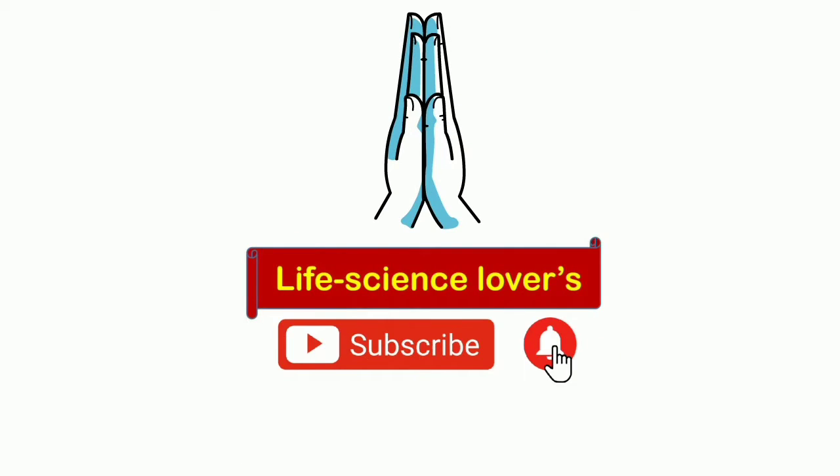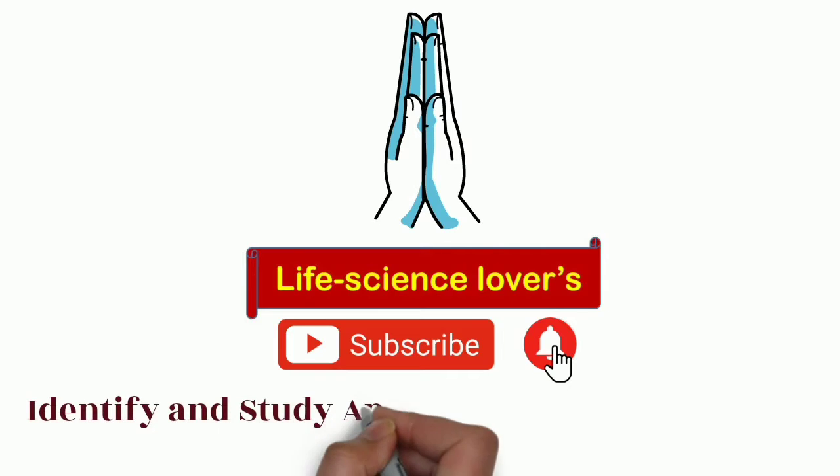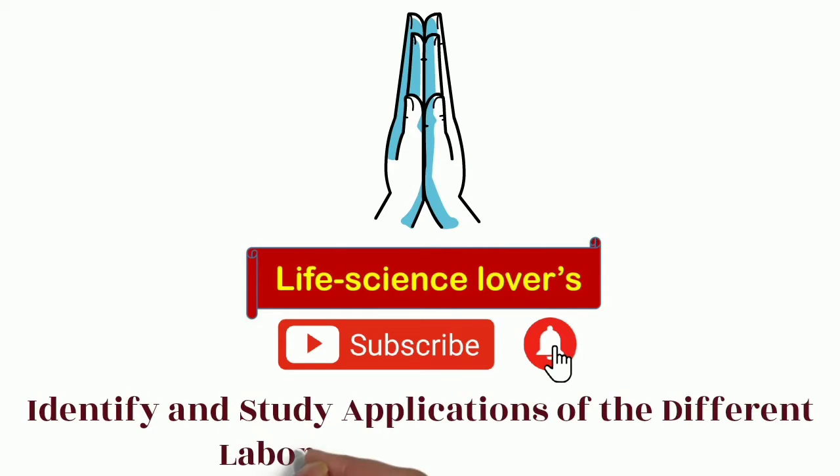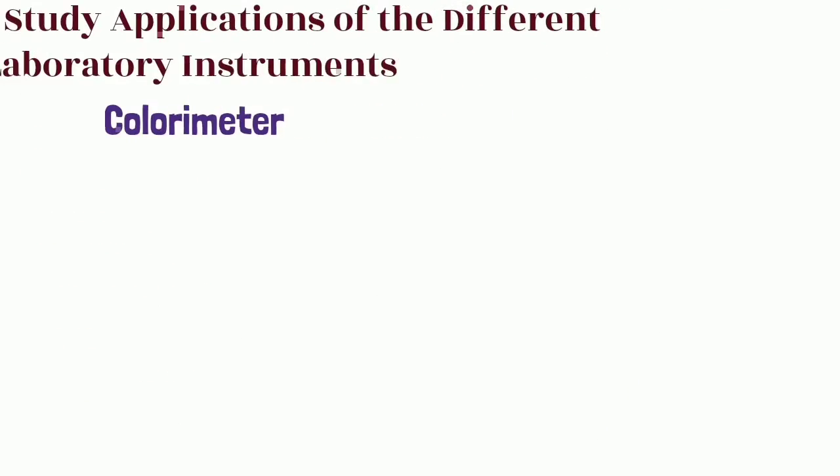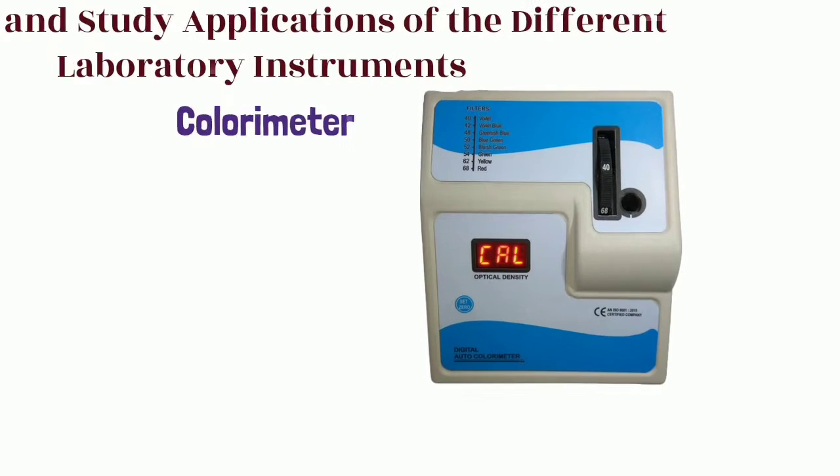We were discussing topics regarding DMLT pathology, all kinds of things. In that lecture we have already covered four topics, but now we will focus on the colorimeter. Everyone knows what a colorimeter is, and this is the picture of a colorimeter.